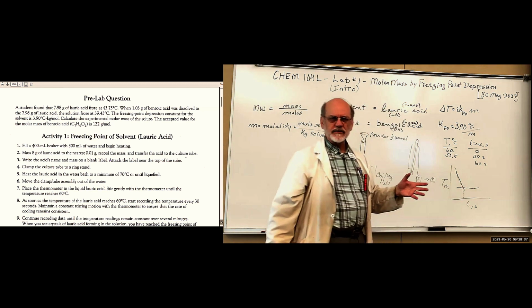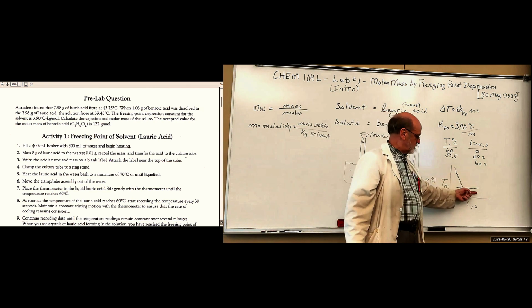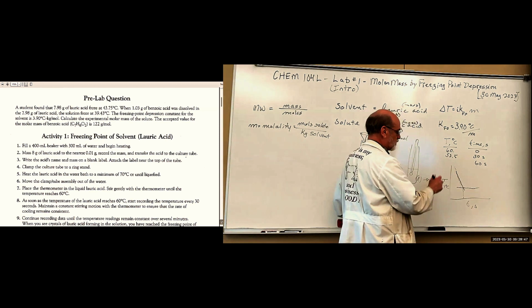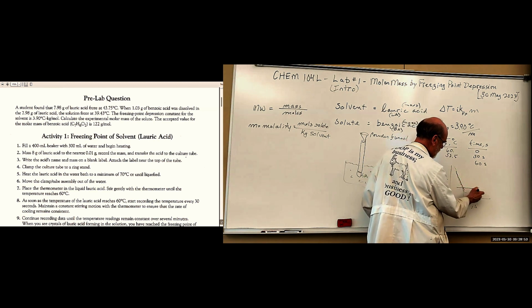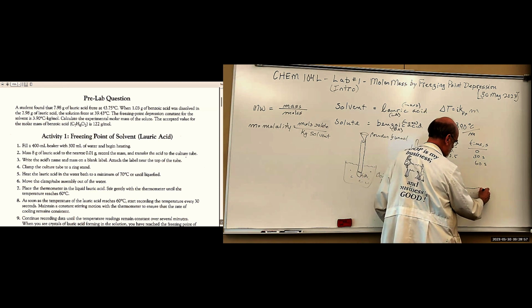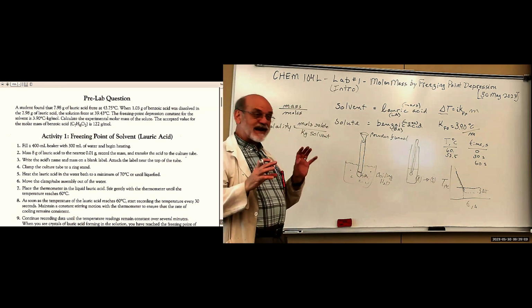But with our thermometers, where we'd be doing good to read 1/2 degree, you can go with the lowest, but I still want you to plot it. And then the second time you plot it, it may follow a similar path here, but it'll go down to here before it flattens out. And this difference in temperature is what we're looking for right there.